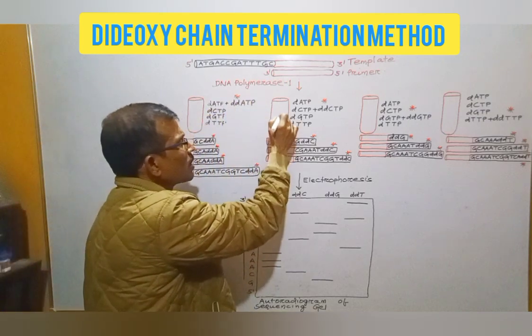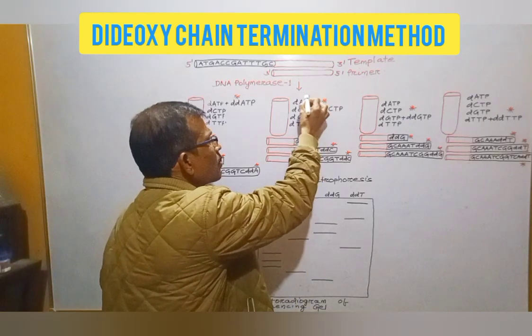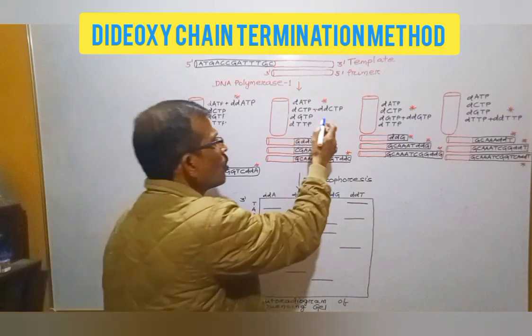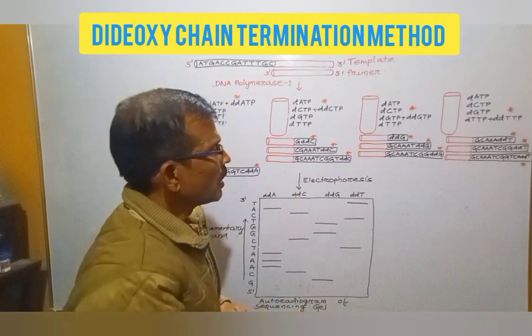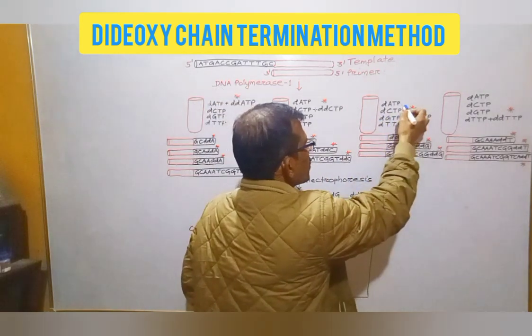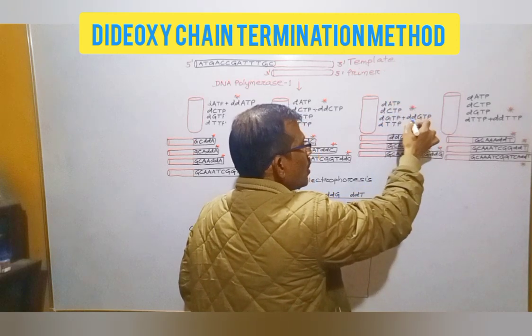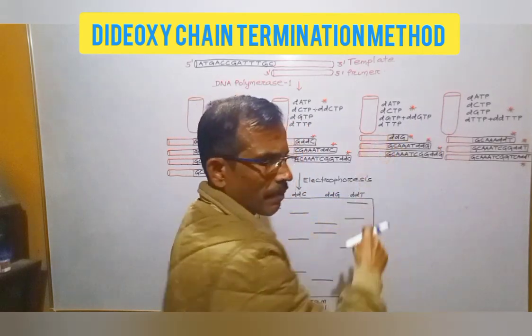In batch 2, the reaction mixture also contains 4 types of deoxyribonucleoside triphosphate plus only labeled dideoxycytidine triphosphate. In batch 3, 4 types of deoxyribonucleoside triphosphate plus only labeled dideoxyguanosine triphosphate are included.